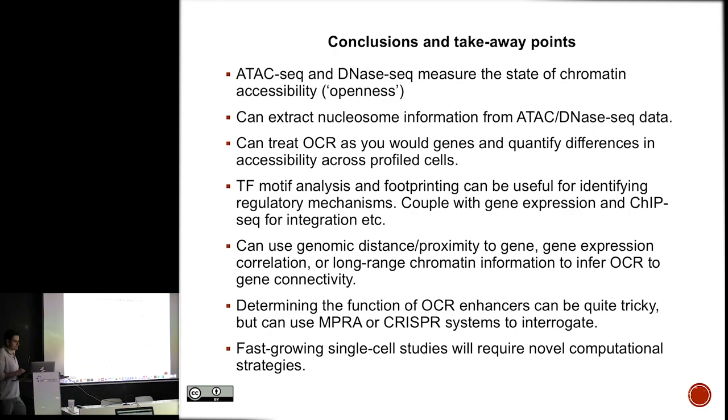Okay. So I just want to reiterate some of the conclusions and takeaway points and open it up if you guys have discussion or questions on some of the things that I've talked about. Like I talked about, I opened up with talking about DNase and ATAC as measuring the state of accessibility, this openness, right? And we can get features like nucleosome information from this data.